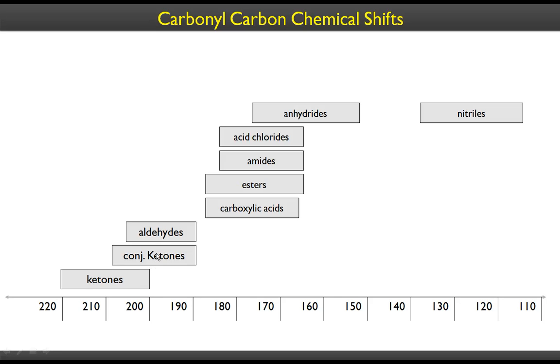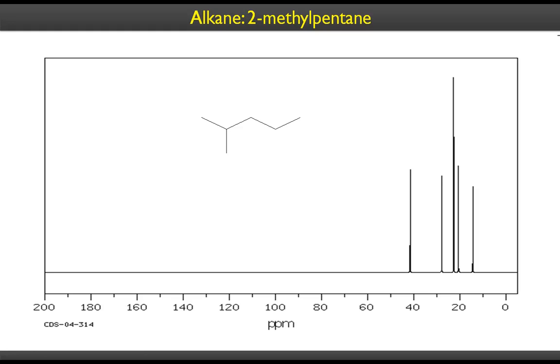So if I have the same molecular formula, and if I get 1 degree of unsaturation from that given molecular formula, and if there is oxygen in that molecular formula, if I am uncertain whether it's a ketone or an aldehyde, just look at the chemical shifts. If it is at 220, it would be a ketone. If it is at 200, it would probably be an aldehyde. Okay, that's the benefit of carbonyl shifts in carbon-13 NMR spectroscopy.